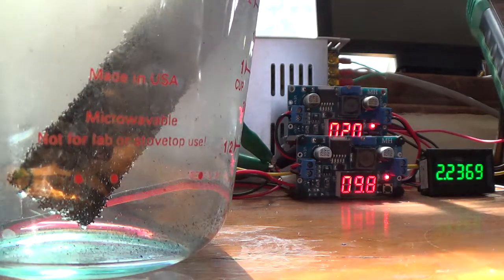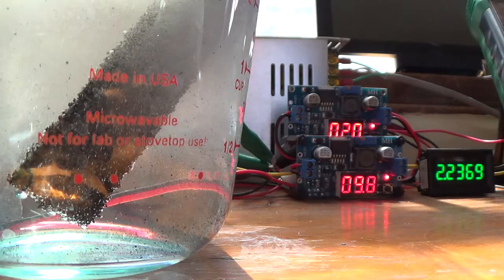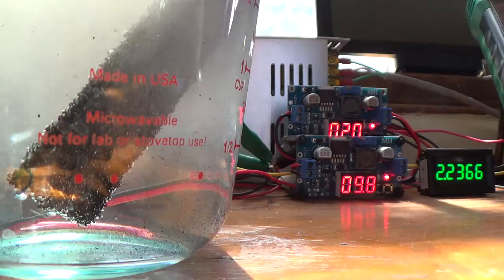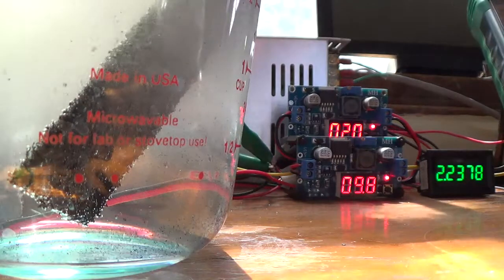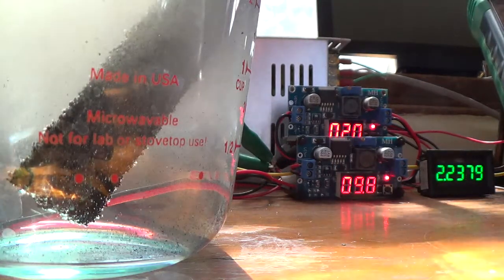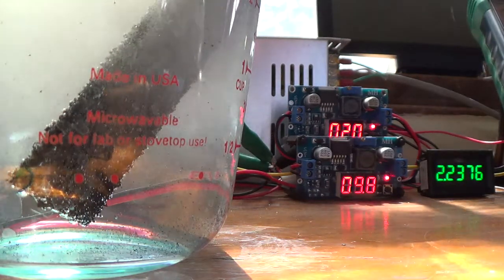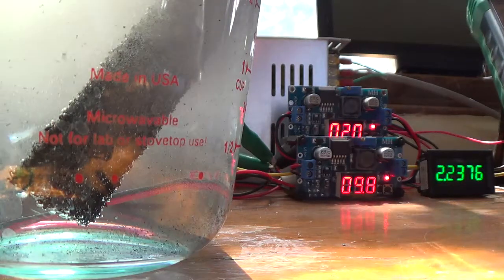With the solution being somewhat more clear, we can see some precipitate on the bottom of the jar. Given the fact that graphene and such is lighter than water, we must assume therefore that what we're seeing is something other.